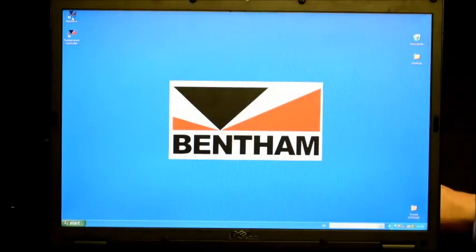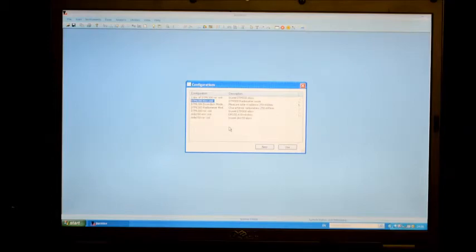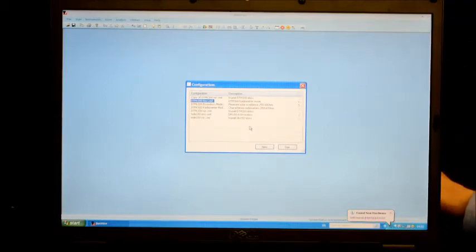Running benwinplus firstly requires one to have the USB connections from the monochromator connected to computer. Connecting therefore, Windows will recognize automatically the interfaces, and after some very short time we'll be ready to go.